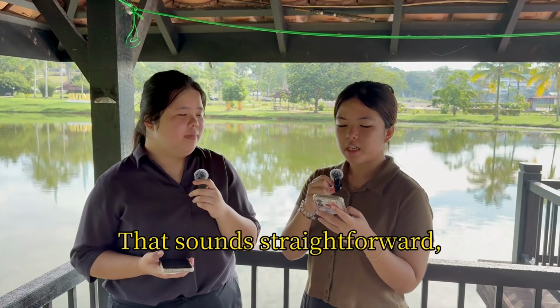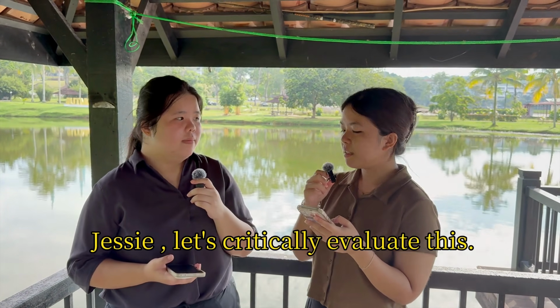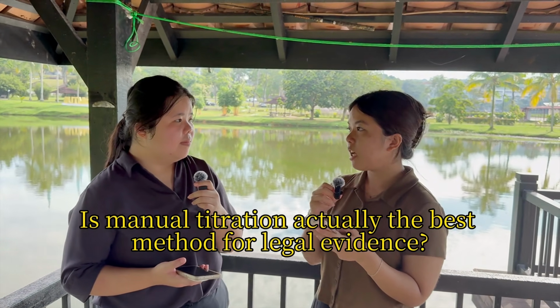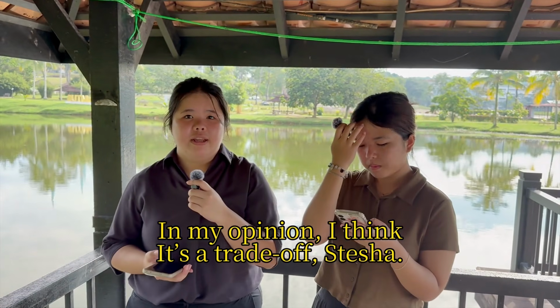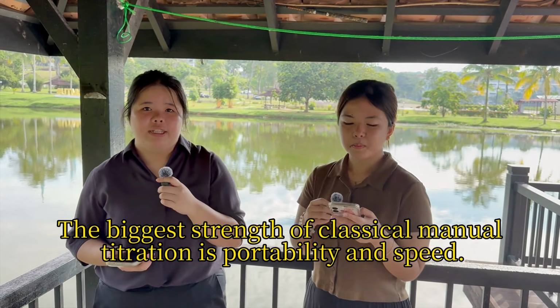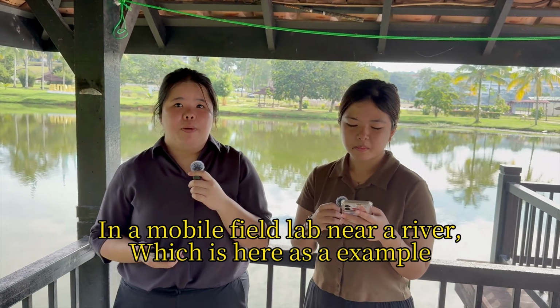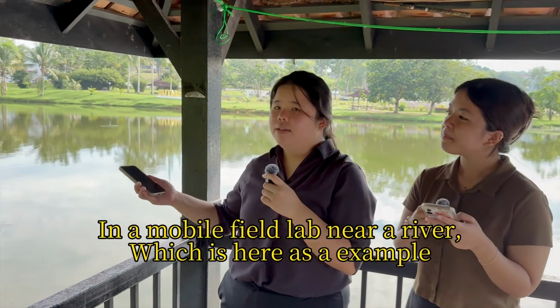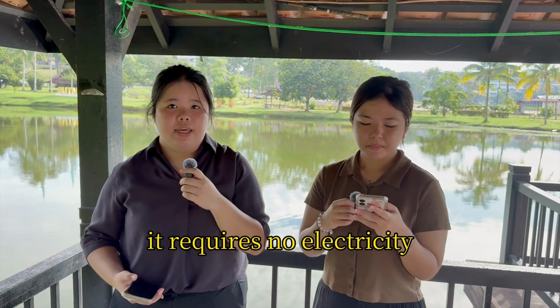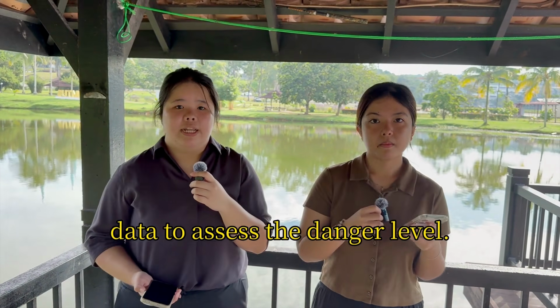That sounds straightforward, but I'm joined by environmental forensics expert, JESSIE LIAU. JESSIE, let's critically evaluate this. Is manual titration actually the best method for legal evidence? In my opinion, I think it's a trade-off, STESHA, because the biggest strength of classical manual titration is portability and speed. In a mobile field lab near a river, it requires no electricity and gives officers immediate quantitative data to assess the danger level.